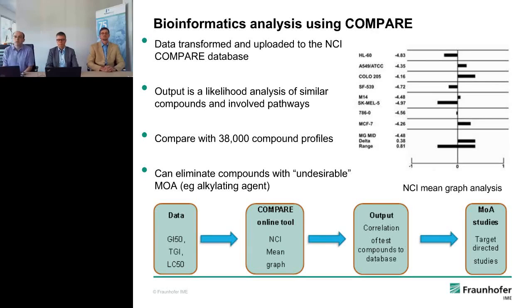So we're doing phenotypic assays, but just as a little bit of background, we're very interested in being able to move from a phenotypic observation through to some information about what the underlying target is. And when we're using the NCI panel of 60 cell lines, I think we've developed 35 assays so far.